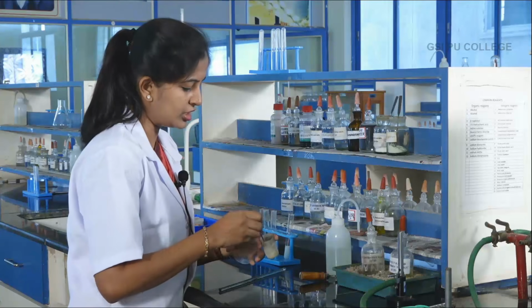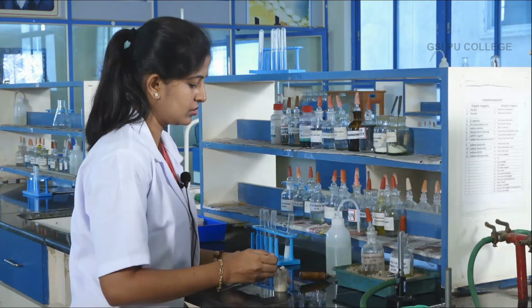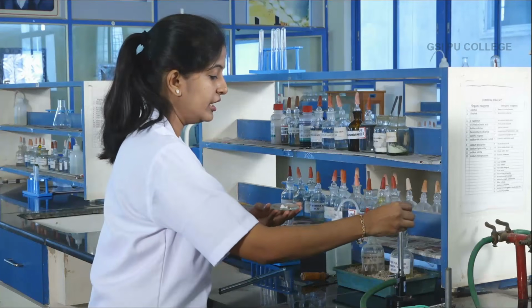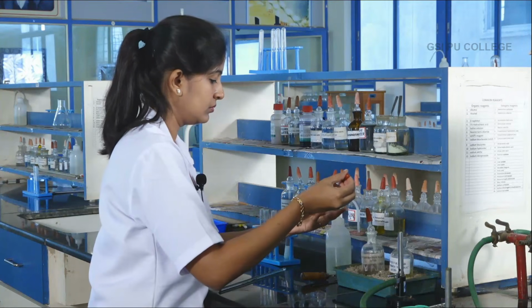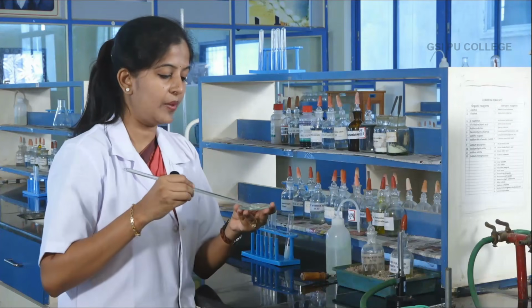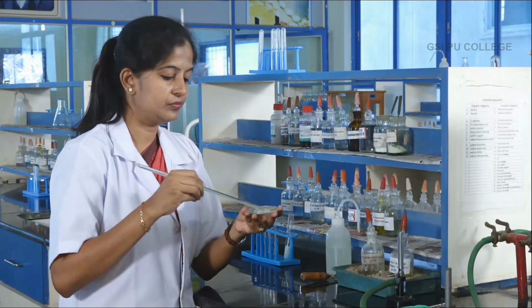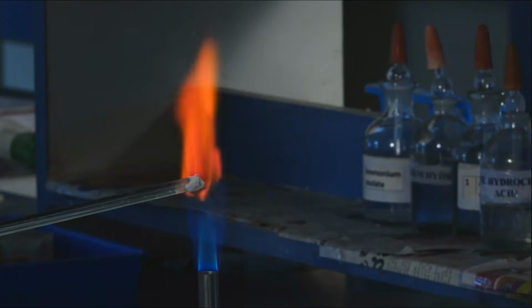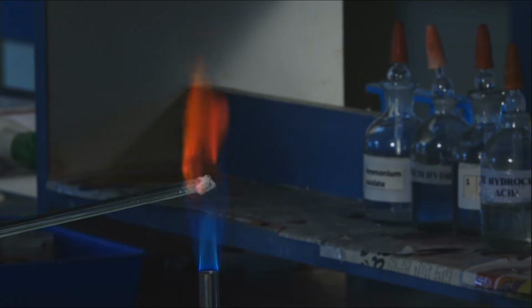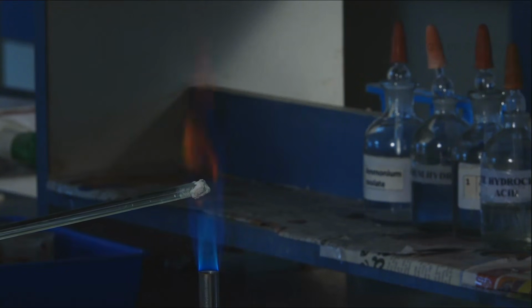So, we are doing a strontium flame test now. Take a pinch of salt on your watch glass. Add 2 to 3 drops of concentrated HCl. Using a glass rod, make a thin paste of this salt. So, you can observe a crimson red color is imparted to the flame, which means that strontium is confirmed.